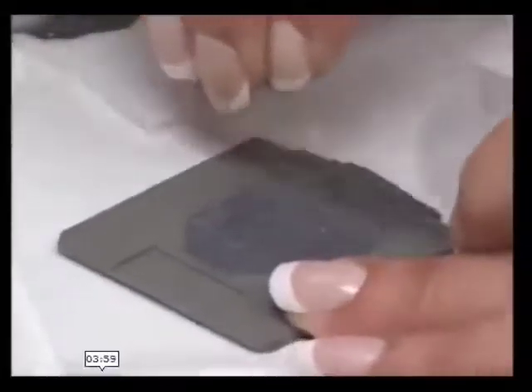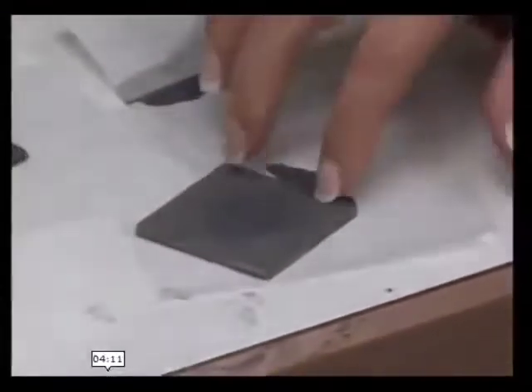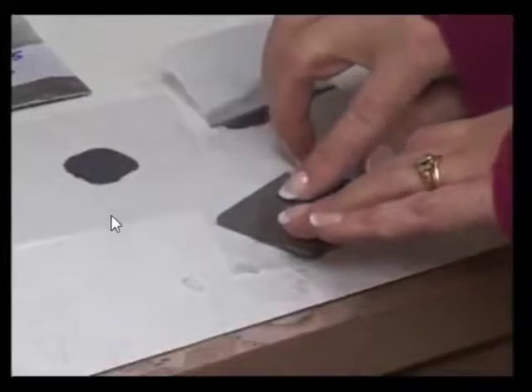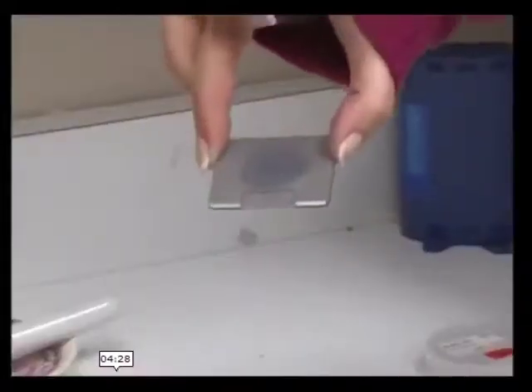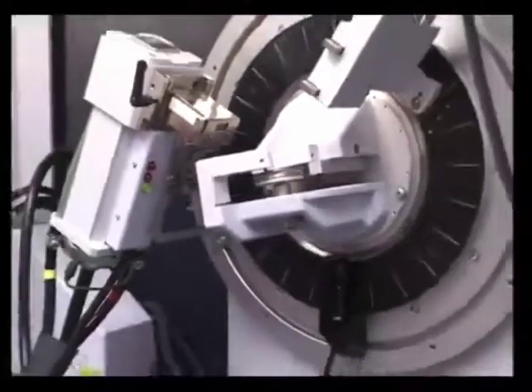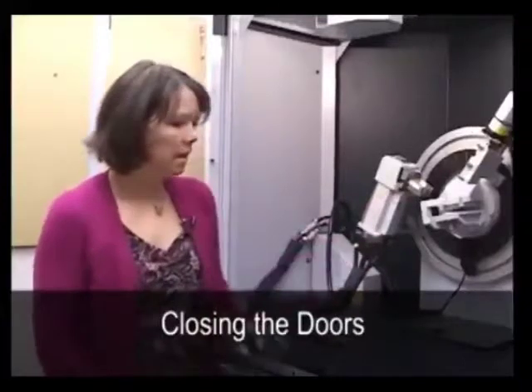Keep in mind, you're going to put this in, and there's going to be 3 pins on 3 places on the sample holder. If there's a lot of material underneath there, that's going to actually alter the angle that it's sitting at, and your positions will be off. Just flatten it down. To verify that, tip it up at a 45-degree angle and make sure that it's very accurate. The plane of the sample must be the same as the plane of the sample holder that is defined by 3 pins. Once your sample is loaded, you can close the doors.